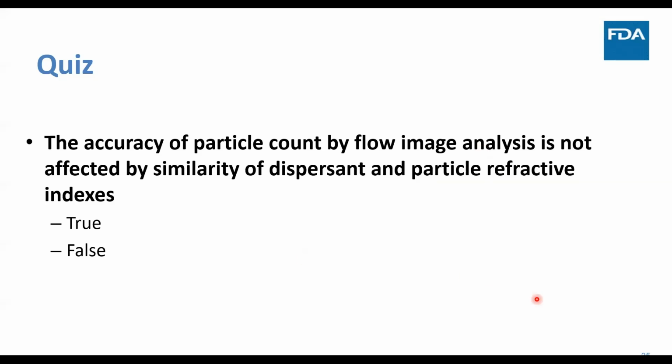So let's take another quiz here and see if I'm getting the points across well. The accuracy of particle count by flow image analysis is not affected by the similarity of the dispersant and particle refractive index, true or false? I'll wait for more answers, then I'll move on.